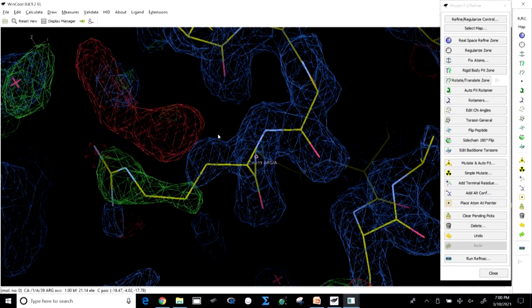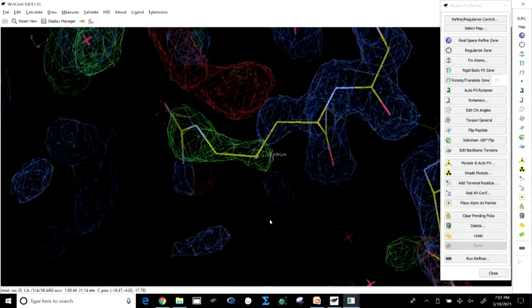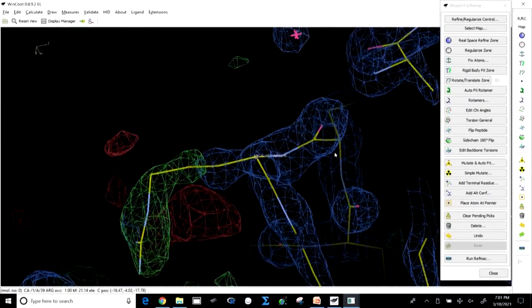So, the crystallographer made a mistake. Now, using Coot software, you could identify the mistake. That is the beauty of Coot. It is not only a visualization interface, but it helps you work like a real time crystallographer. So, I hope I could make this point here.